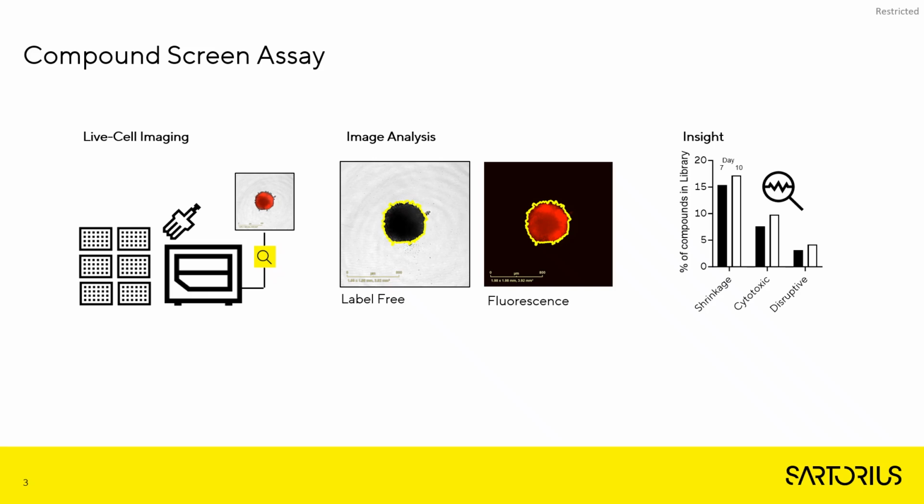In total, 22 96-well plates were treated, with 2 replicates per compound plate. Compound effects on spheroid growth, shrinkage, and viability were quantified using the IncuCyte system and analyzed using the IncuCyte spheroid analysis software module. Integrated intensity is used to reflect changes in both spheroid size and fluorescence to provide a quantification of viability.